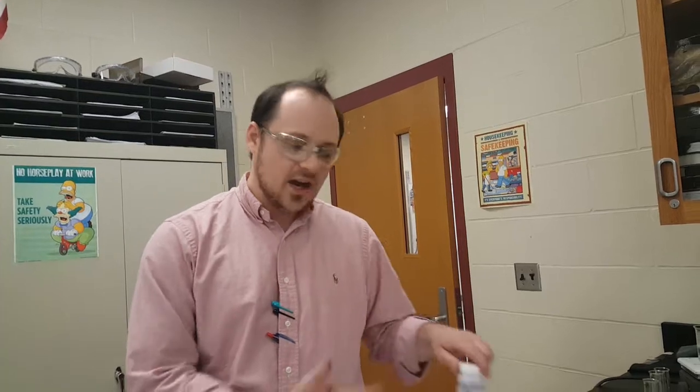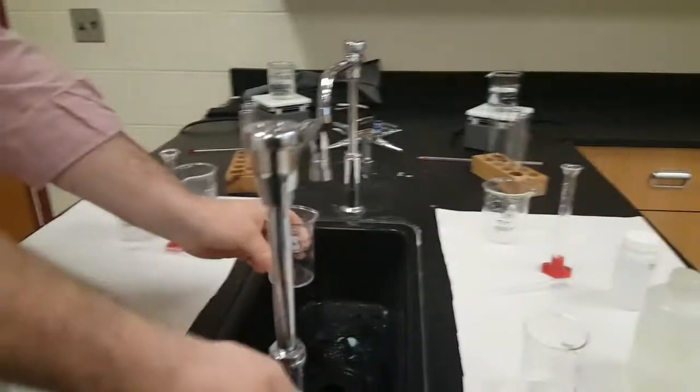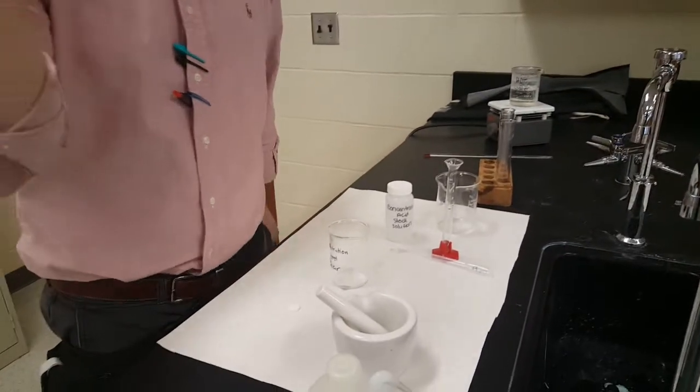Okay, good. I want to see a data chart: high concentration versus time. How long it took, how many 1 Mississippis, or seconds, it took for that tablet to completely react with the 20 mils of the concentrated acid. We might even have, if we're lucky, a timer running for you on a smart board, so it'll make that a little easier. Once this is reacted, you're going to have some sludge in here. Rinse it with water. It's neutralized, goes down the drain. You got a nice, fresh, empty beaker here. You got to do the second trial for the first procedure.